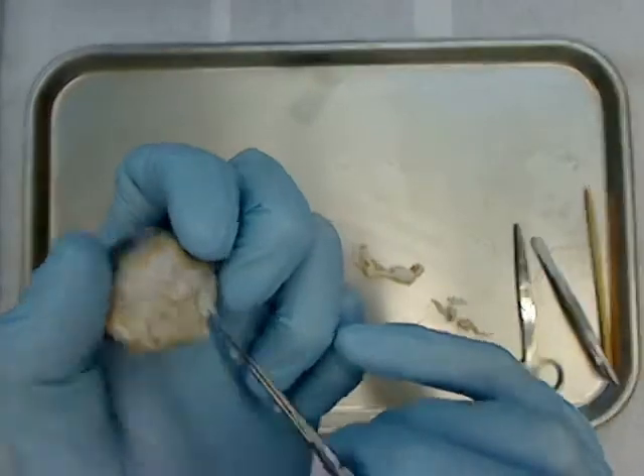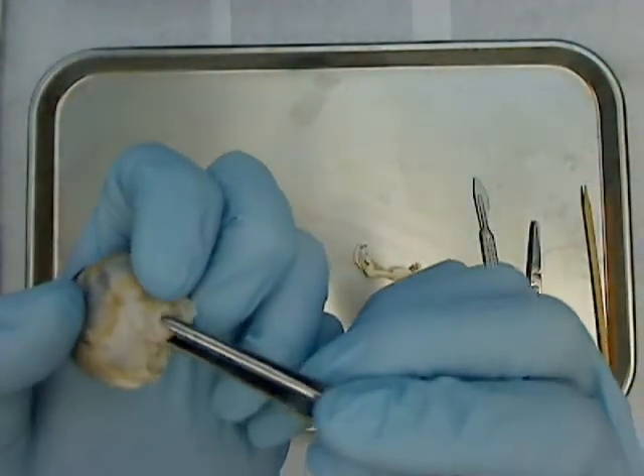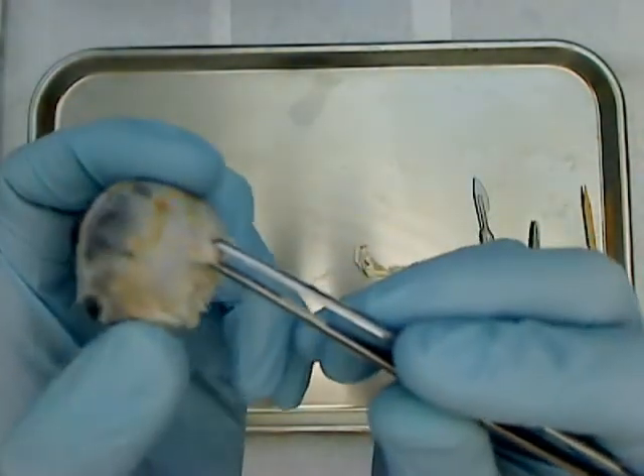I've reflected as much tissue as I can away from here. This isn't a great specimen, but this structure that sticks out of the back of the eye is the optic nerve.